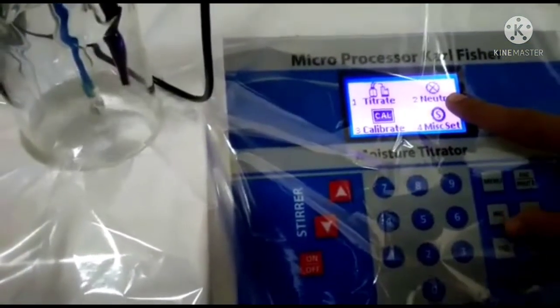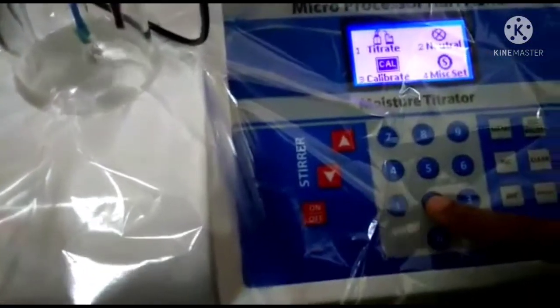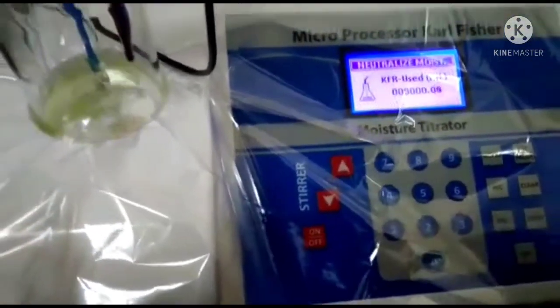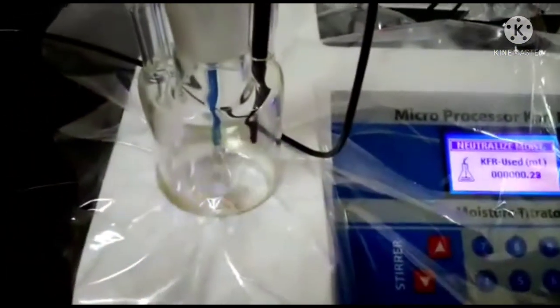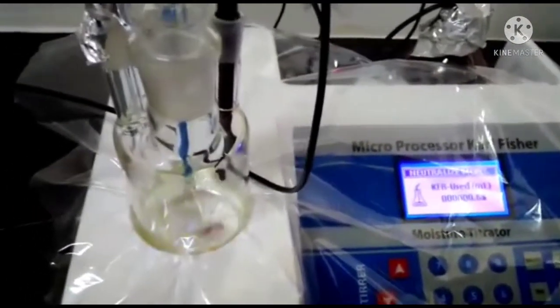For neutralization we have to press option number, as you can see neutralization is available on option number 2. We have to use the same key to start the neutralization. I am pressing option number 2 and now you can see the reagent is being added.